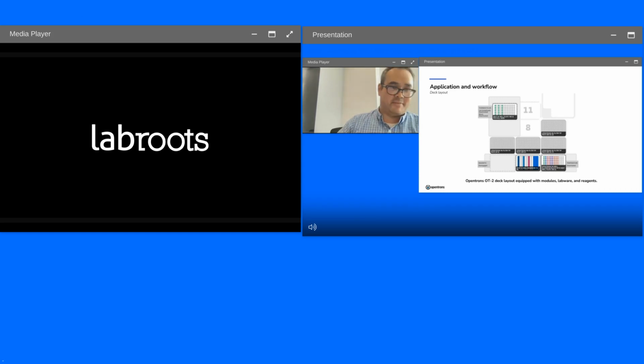So in the top left, you have a thermocycler. It is pretty bulky. It's an on-deck thermocycler from Opentrons, but it does take up positions 8 and 11, as you can see. Down in the bottom left is the magnet module. Down the bottom right is the temperature module. My approach was to have all the reagents sort of pre-aliquoted onto a 96-well plate and kept at 4 degrees throughout the course of the protocol.